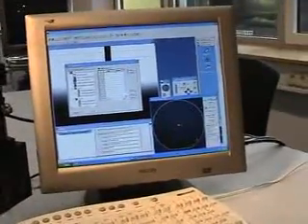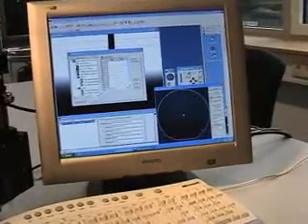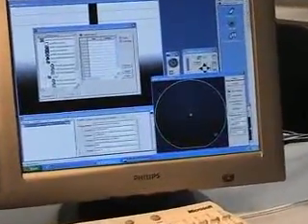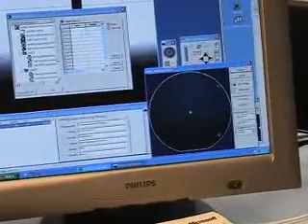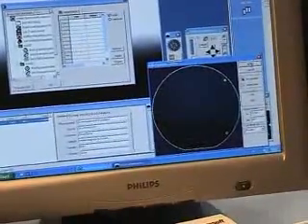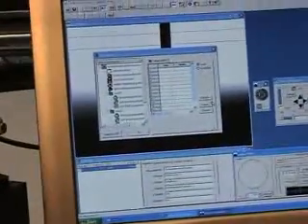Now we are going to define the different dosing positions on the wafer. Here we have a short look on the polar mapping for the wafer and now we can easily assign different positions on this wafer, even test this position and directly take over the position.